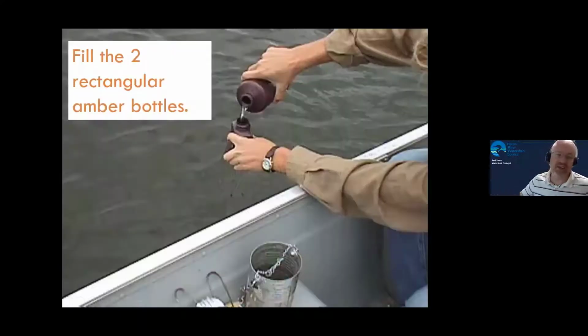Oh yeah, I was going to mention one thing that you want to do whenever you're dealing with chlorophyll samples: you want to keep things well mixed, but you don't want to shake them like crazy and start breaking apart algal cells and stuff like that. So when you do this step of pouring, you can swirl your bottle, or you can slowly invert your bottle. You're just doing gentle mixing, not really vigorous mixing. That ensures that the algal cells are fully distributed in your water sample.